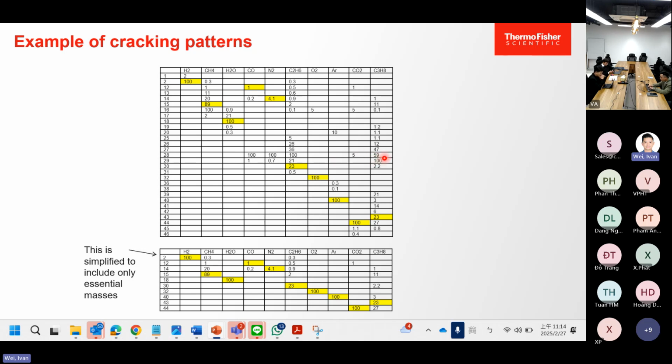They do have some chance to break into a molecular weight of 28. So we need to simplify the numbers to make sure all these compounds have a distinguished molecular weight that does not interfere with other compounds that we want to measure.